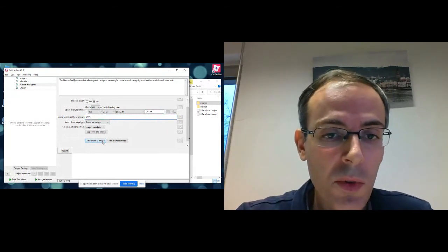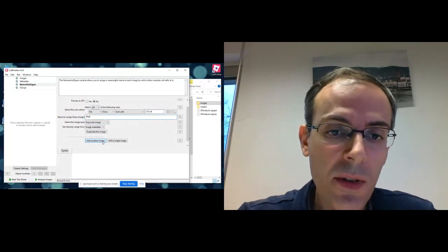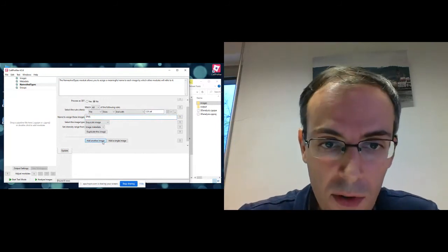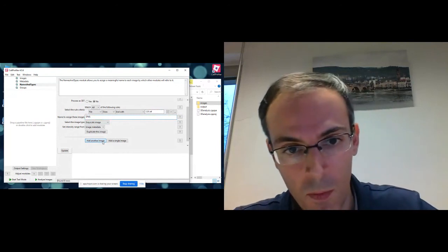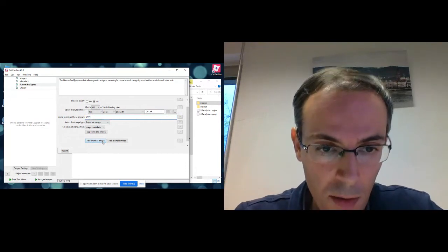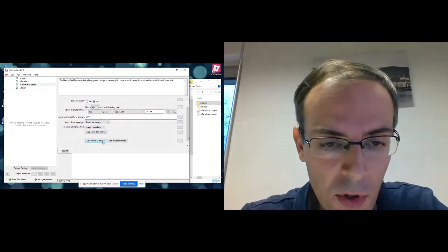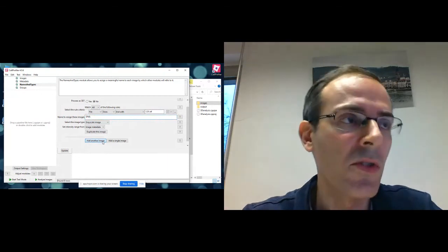In case of 3D images, we need to specify relative voxel sizes in X, Y, and Z. For this particular data set, it's 0.76, 0.76, and 2. If we click update, we can rest assured that CellProfiler correctly interpreted these images, where it found 4 image sets, each of them composed of 2 imaging channels.